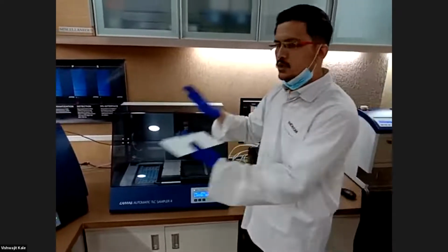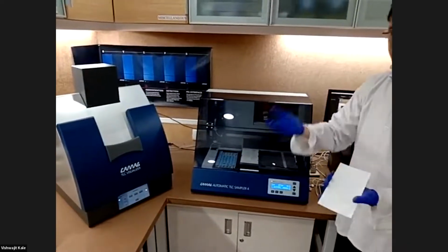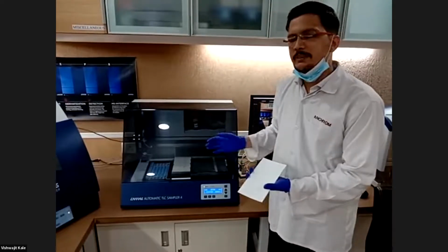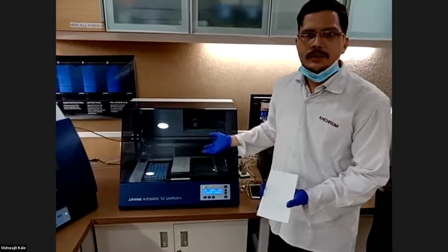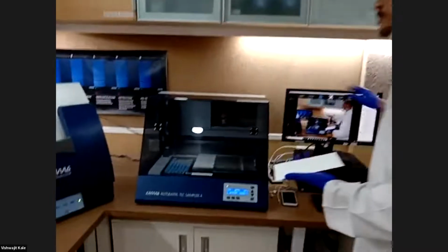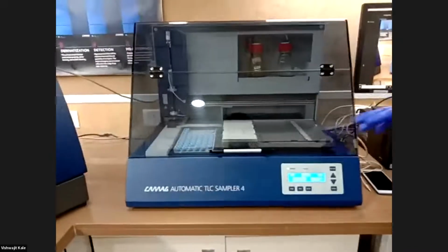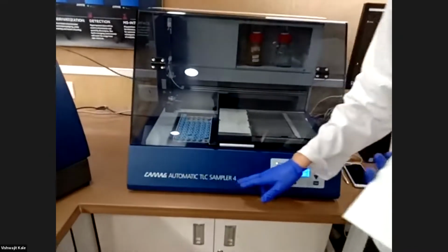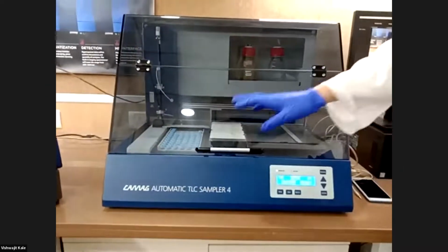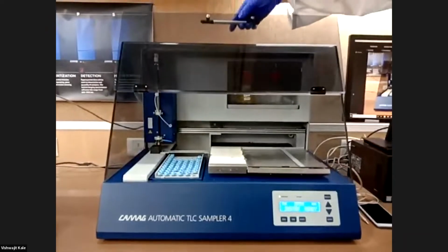But when one module is engaged, any other user can't use that module at that time. But after completion of that modular step, another person can operate that module easily. So in this HPTLC system, this is the sample applicator, the HPTLC applicator. This is called ATS4, Automatic TLC Sampler 4 by CAMAG with auto sampler tray. And it is working on the spray-on technique.